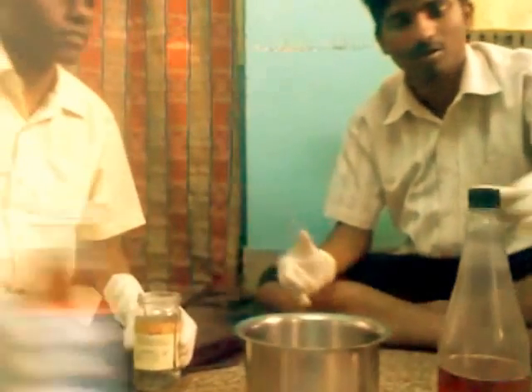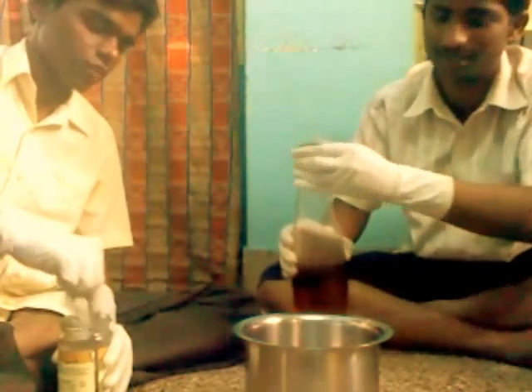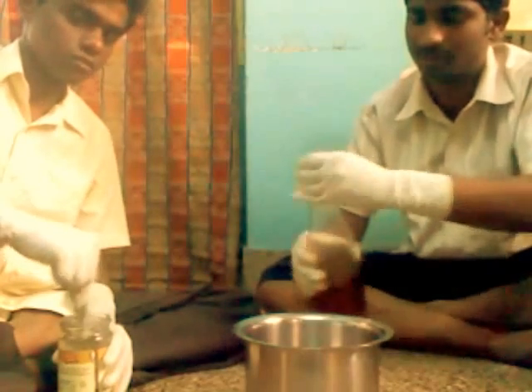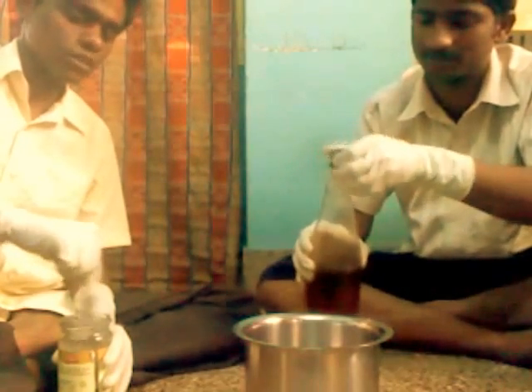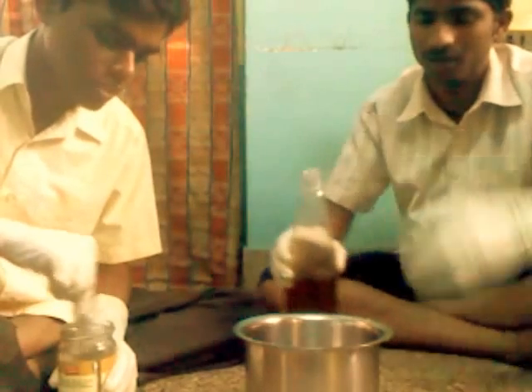Now we have to pour 1 liter of oil into a container and then heat this mixture so that any water content in the oil can be easily removed.